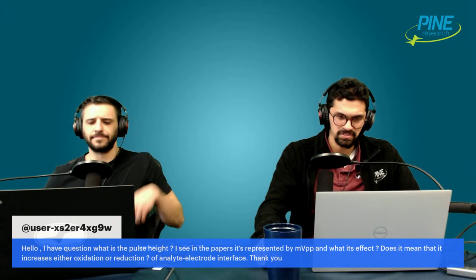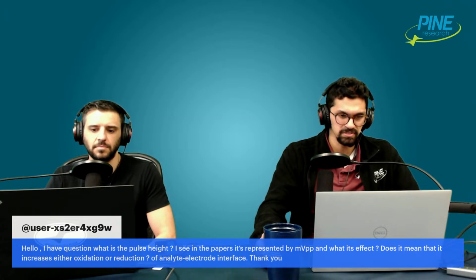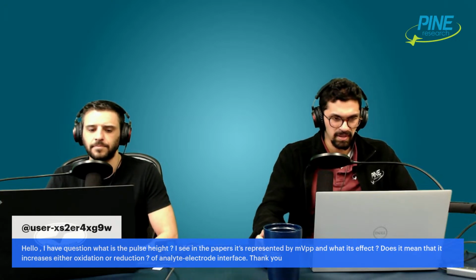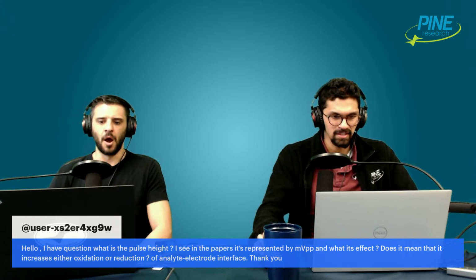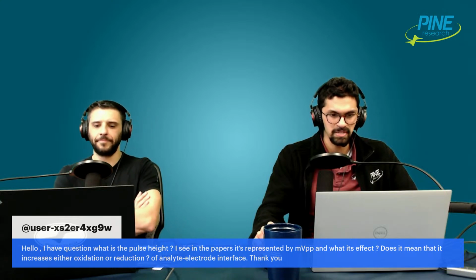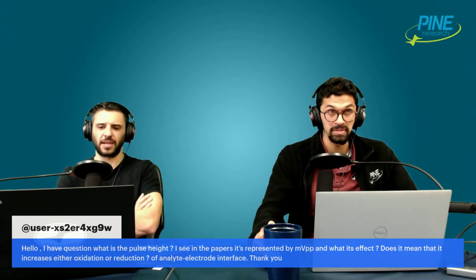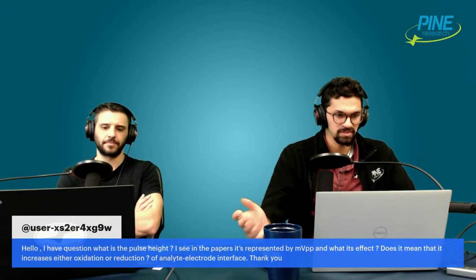I think I did want to answer, or at least comment on this one, because this was a YouTube comment, or a question, from almost 2 weeks ago that I didn't have a chance to talk about. This was with respect to square wave voltammetry and describing what exactly pulse height is, as well as how papers sometimes refer to it as millivolts PP, which I think is millivolts peak to peak. And what does it affect, and what does it mean? Does it increase either oxidation or reduction of the analyte?